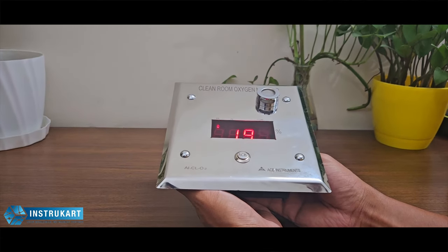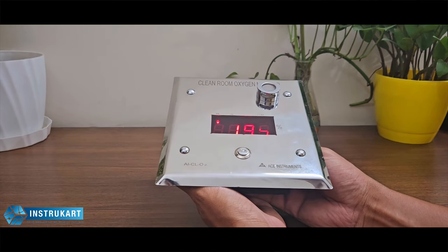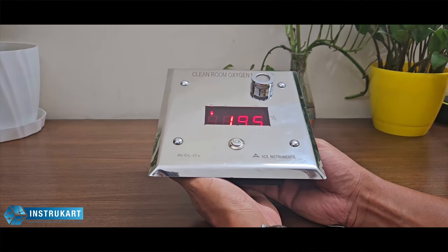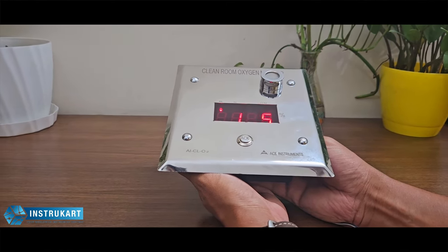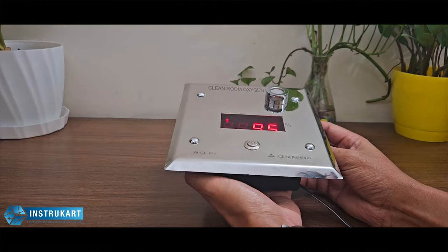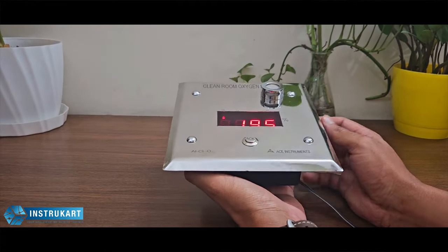It has got all the communication options which are required, which means it can support the analog output 4 to 20 milliamps, it can support RS-485 Modbus communication, and it can also be available in LAN, which means an RJ45 cable can be inserted into this monitor for direct communication with your internal system or the LAN.